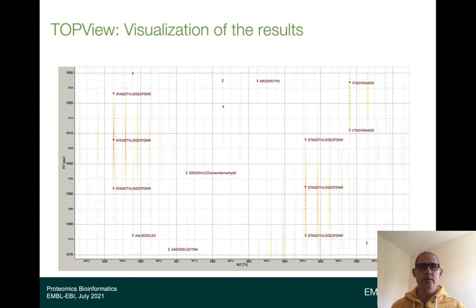The best tool to visualize the output data from OpenMS is TOPPView so far. There are other tools, like R packages and so on, that are quite well integrated with OpenMS, like MSstats.